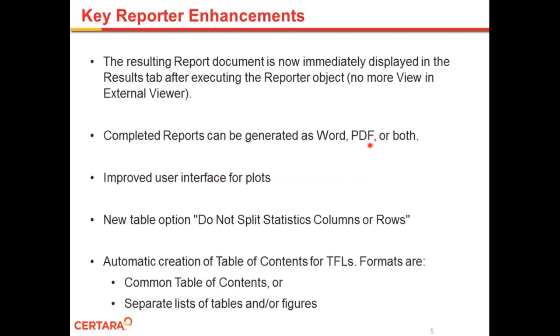And there's an improved user interface for plots, as well as some additional options for tables. For example, do not split statistics in columns or rows. There is an automatic creation of table of contents for tables, figures, and lists, and the formats are the common table of contents or separate lists of tables and figures.